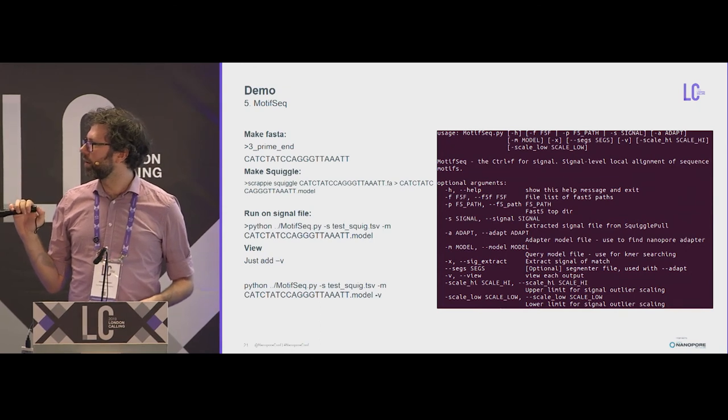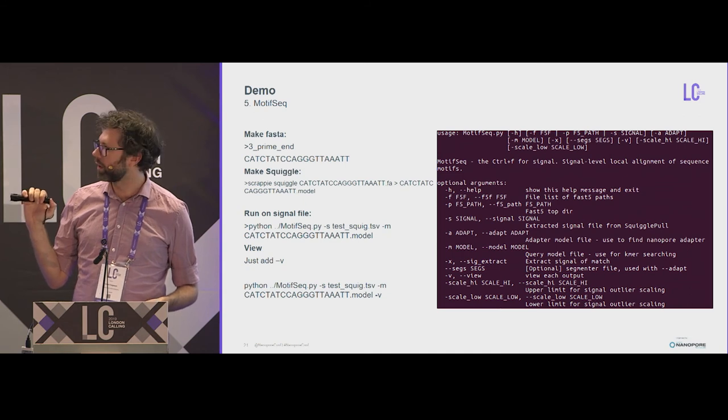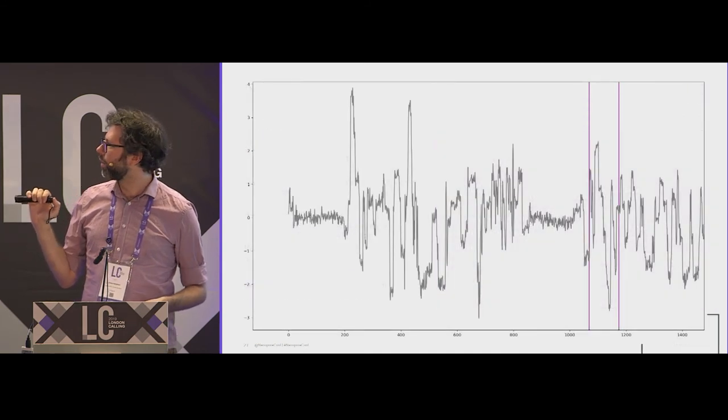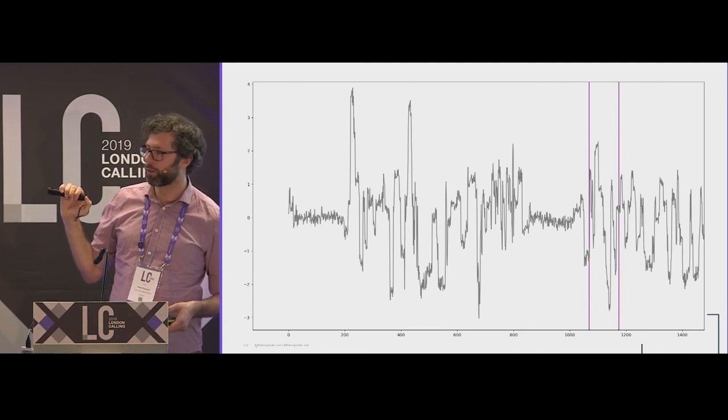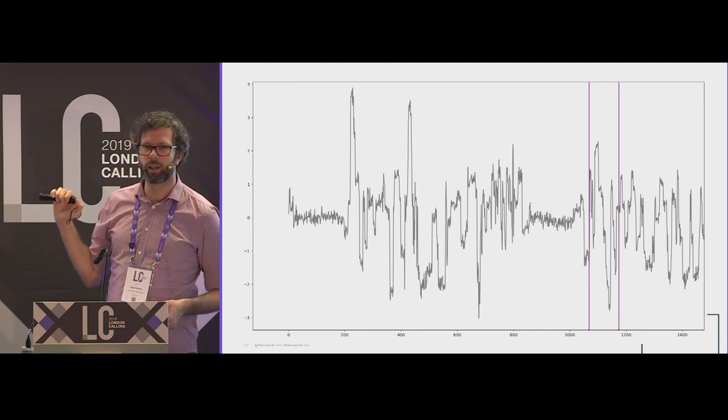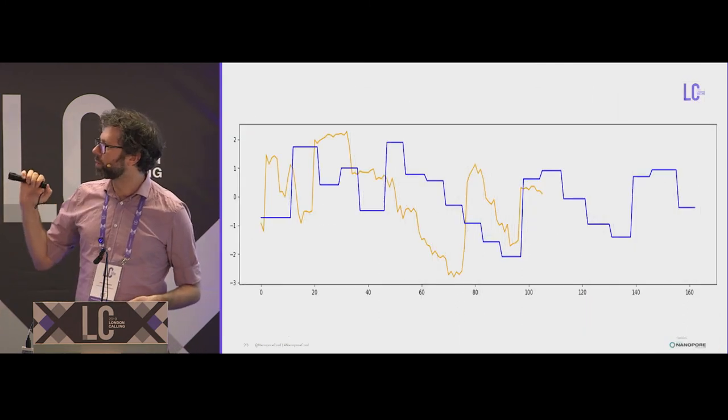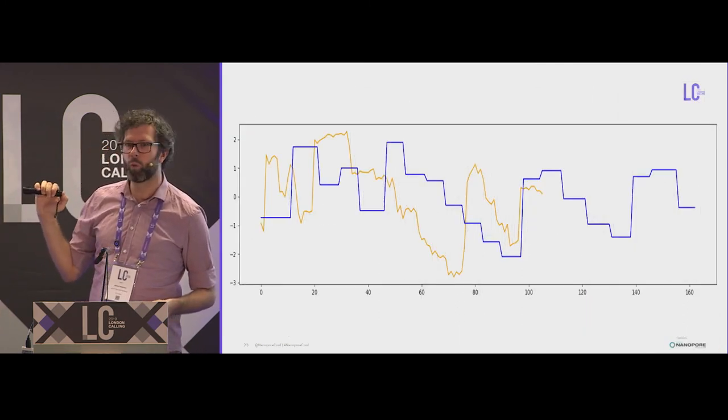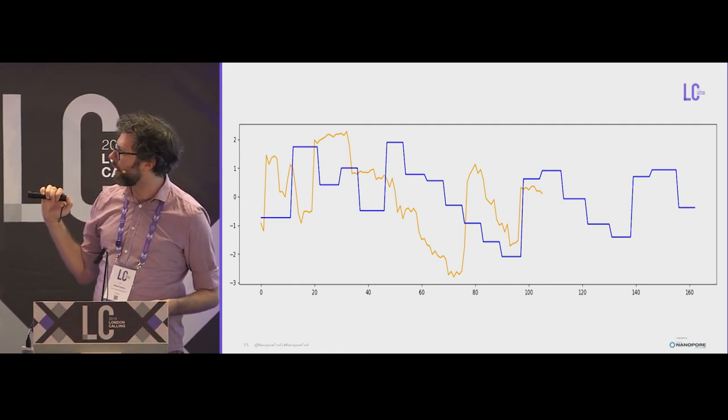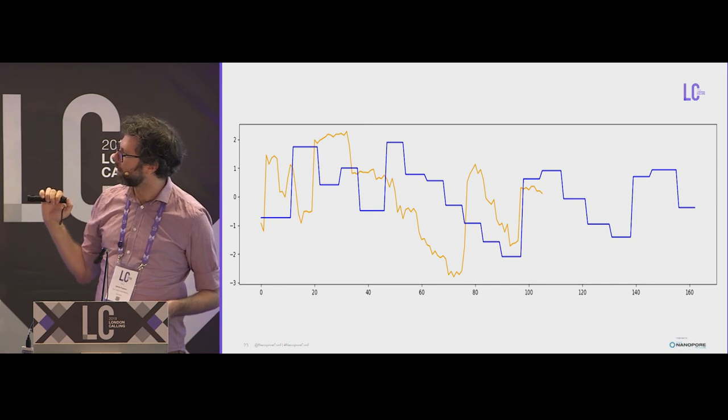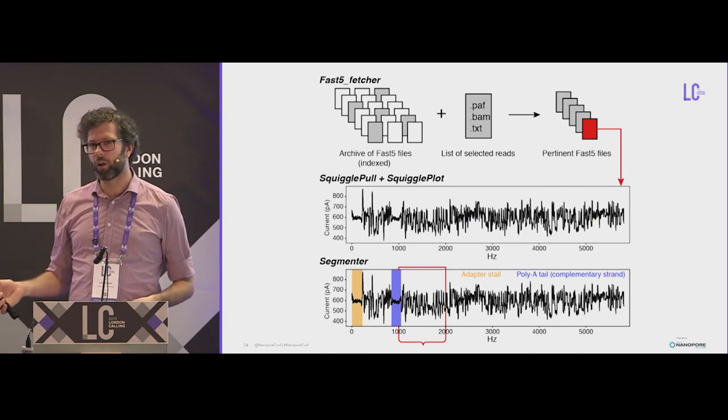Then with MotifSeq, you can then feed a model in that you can make with Scrappy, the synthetic model. And then that can also target exactly where it is. So this was targeting the particular correct three prime end. And if you do it with the other one, it doesn't hit this point. And based on the positions, you can tell if it was real or not. And this is what the synthetic versus the real signal looks like. Now you can see it's warped quite heavily, but the peaks and troughs all kind of match up. This step pattern here is this step pattern here, for example. And so that's kind of an example workflow that you might work with.